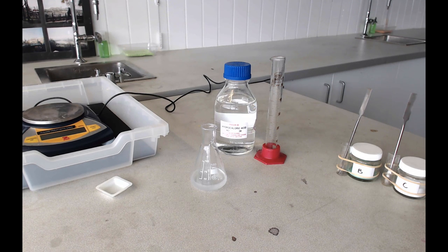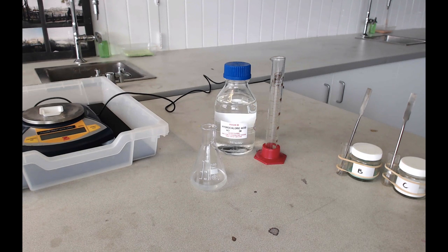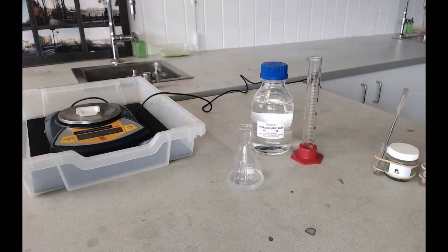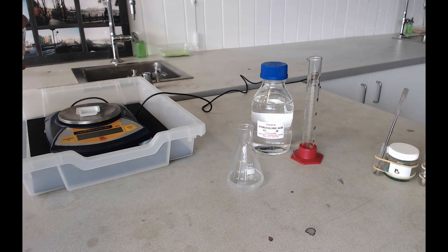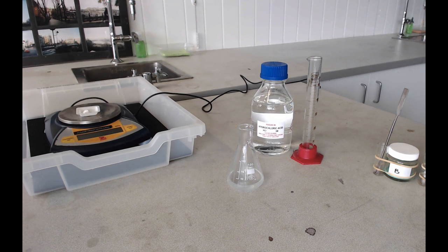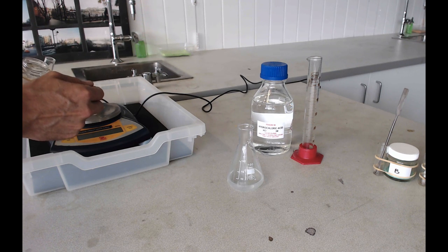Now the next thing you want to do is weigh out 2 grams of your carbonate using the balance and the weighing boat. 2 grams of each of these carbonates is around about 2 spatulas full. You want to be very careful when you're weighing these things out. Put your weighing boat on the balance, reset the balance, and then carefully place about 2 spatulas full of solid onto your weighing boat. The closer the jar is to the weighing boat, the less likely you are to spill the powder all over the balance.